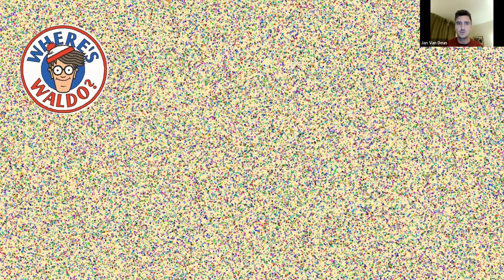So you have, of course, some of these Waldos wandering around in the plasma, but most of it is, of course, free protein, but also a lot of other particle types. So lipoproteins mostly, which outnumber EVs, as you can see here. So it's really this soup of lipid particles, and maybe also some protein aggregates, where the EVs float around in, but it's of course really difficult to look at the EVs themselves. And then even after isolation, usually the image looks like this. So there's still a lot of lipoproteins there, which might interfere with the detection of the actual EVs.